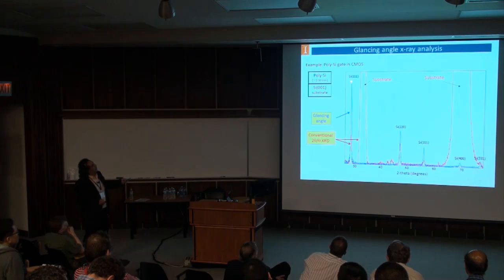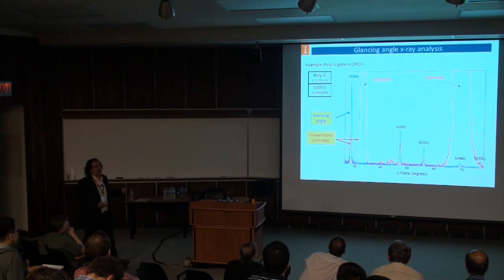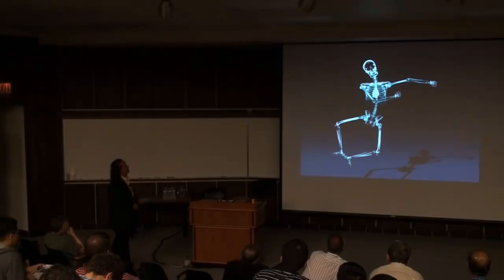So then the peaks from the surface, from this film here, show higher. Look at the blue ones. Even one that was hidden there can appear now. You can measure it, so you get a much better quantification. You have a lot of examples where, by using glancing angle, not only can you emphasize the intensity from the film, if it's thin, but you can also probe different depths. You can actually play with that.